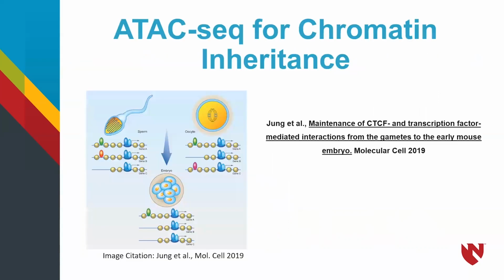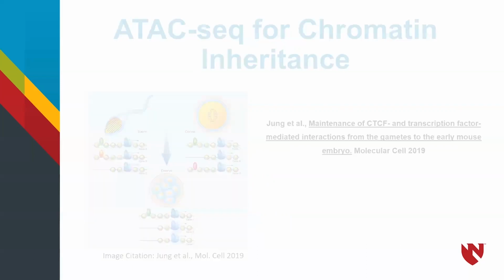In another example, ATAC-Seq has been used to define chromatin features that are inherited and persist from gamete to embryo and revealed greater accessibility in sperm than previously expected. These studies, along with numerous others, provide a wealth of information that can be used to define new hypotheses, support current research, and drive innovation forward. Therefore, learning to analyze these datasets effectively is an important skill set useful in a wide range of research areas.